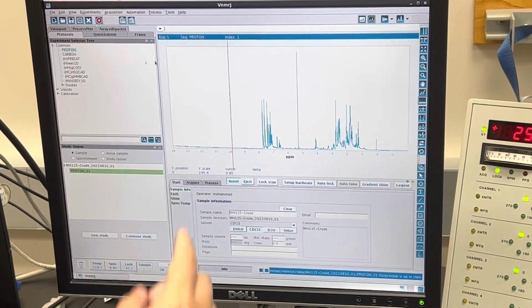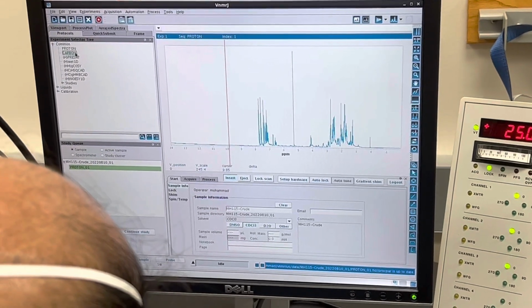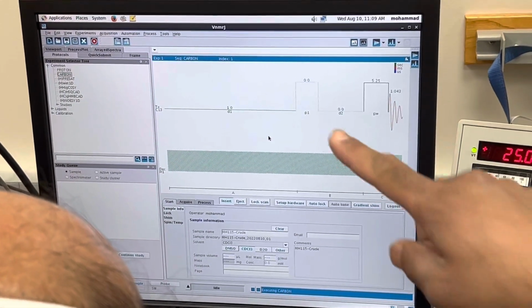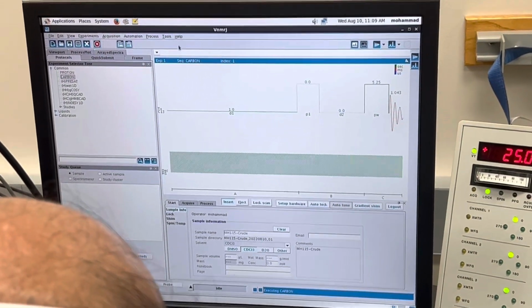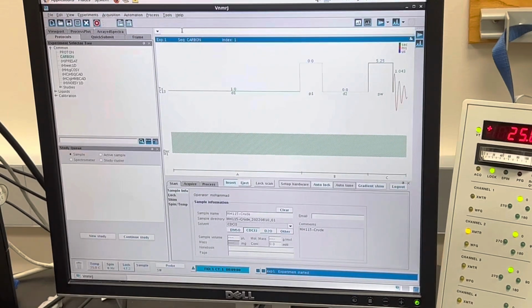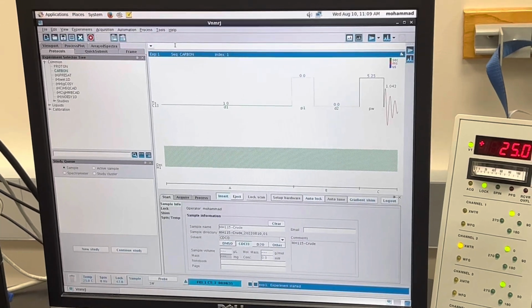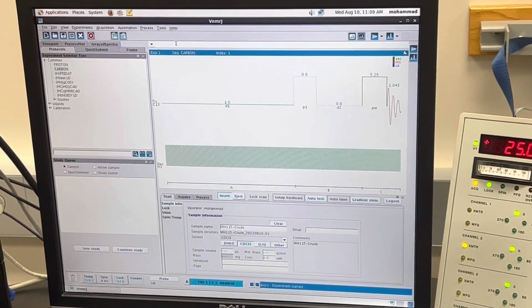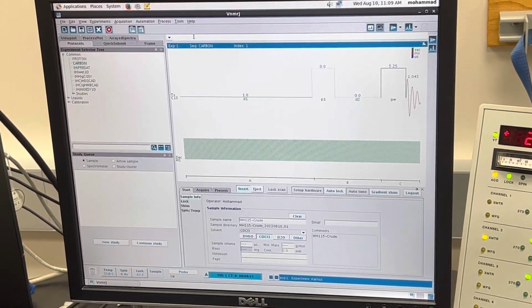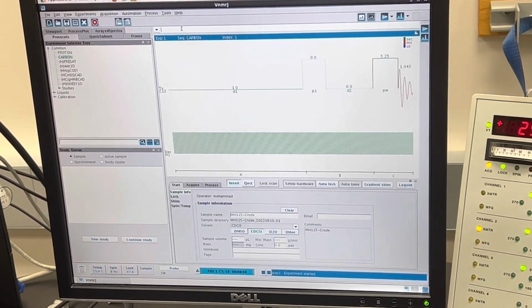And then once it's done, if you want to run carbon, check carbon here. Don't double click right now. Just drag the carbon here. Then go. GO. What was the other one, like GA? GA means go and acquisition, plus WFT. It's the same thing, but with the plus WFT: acquisition and then process it. Okay, then that's the way to run carbon.